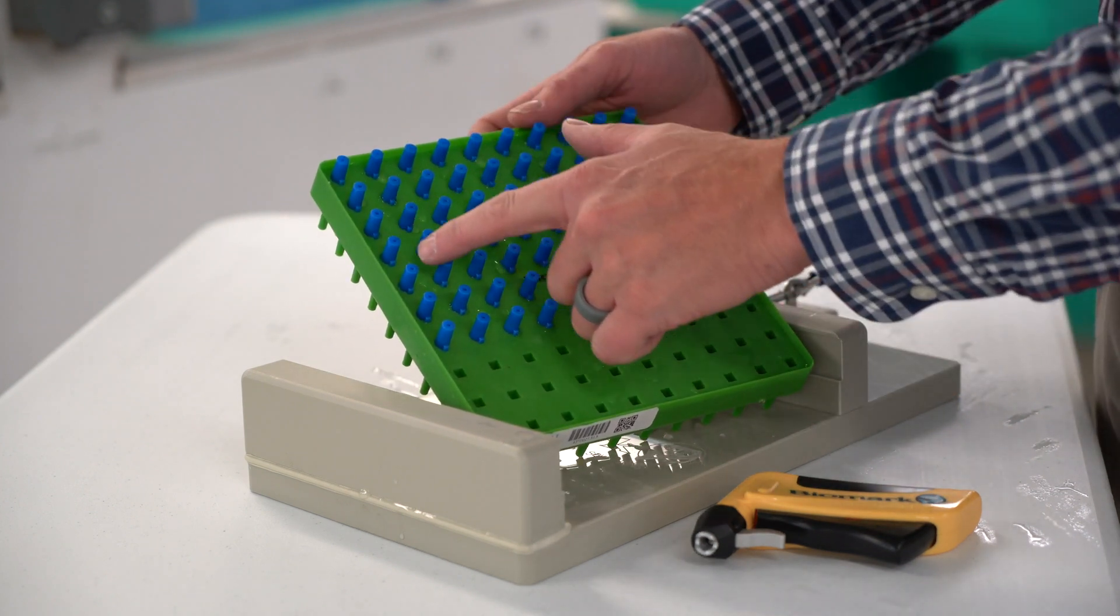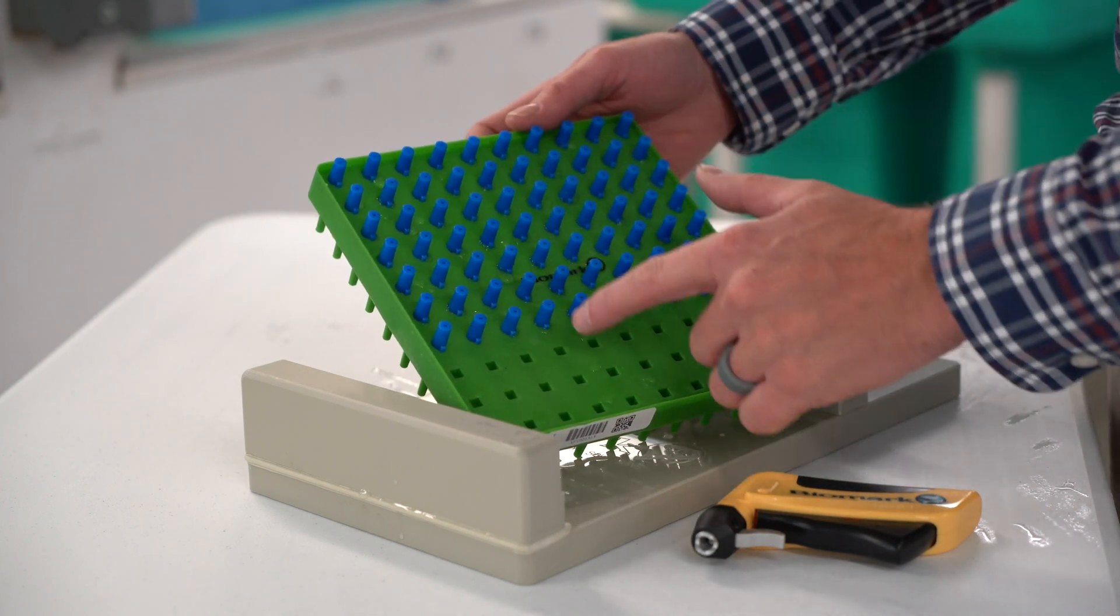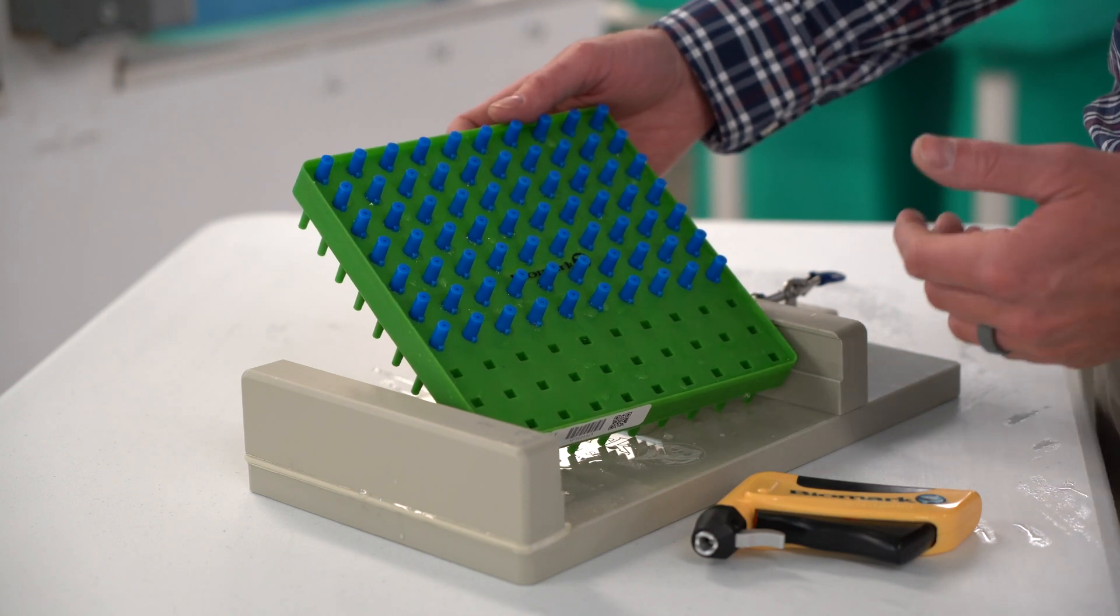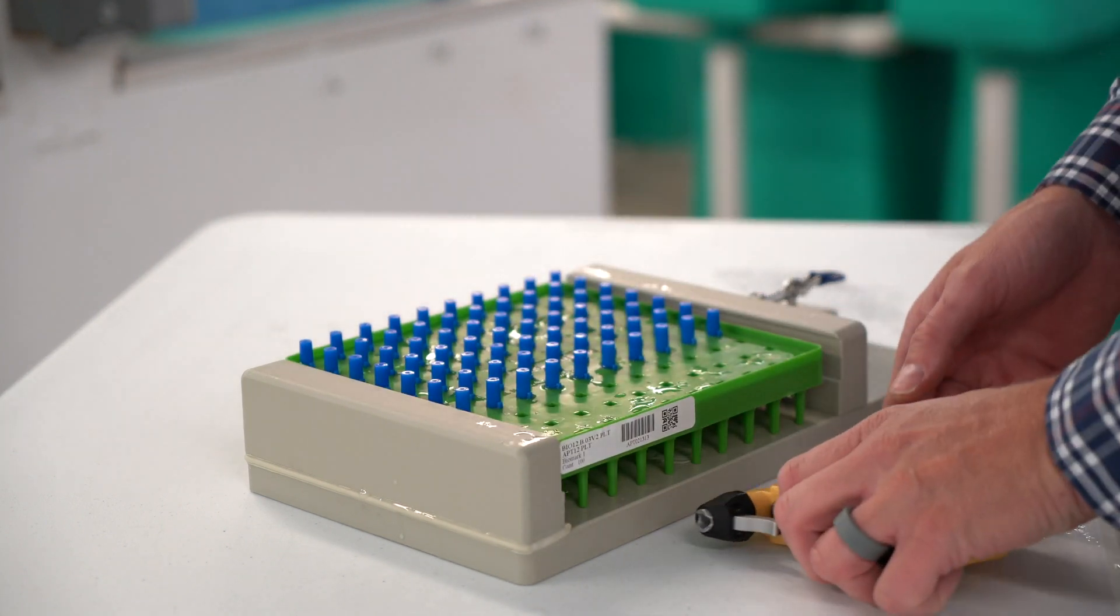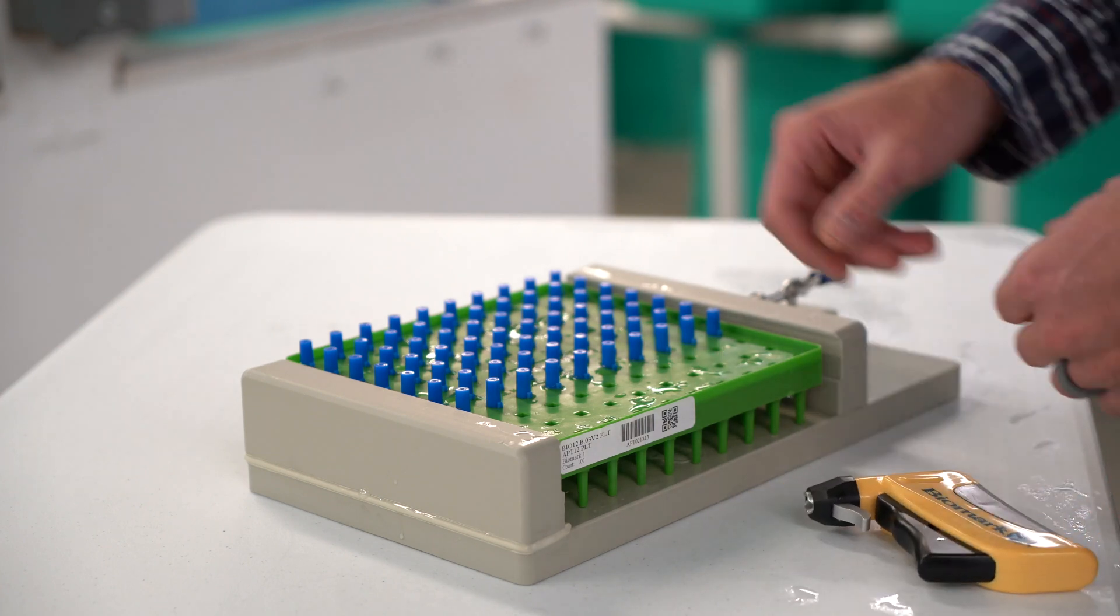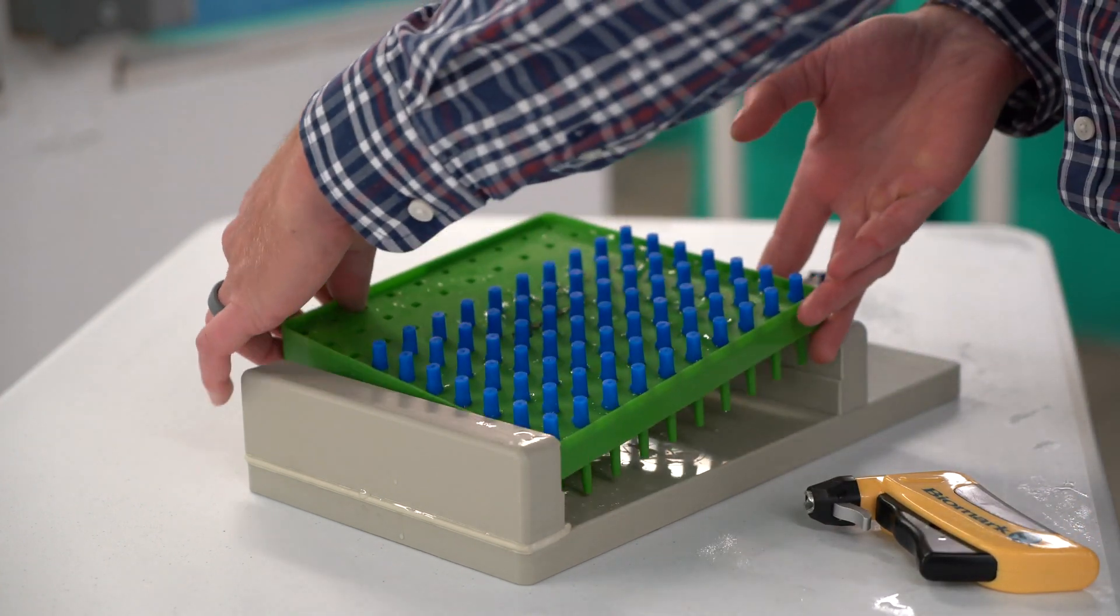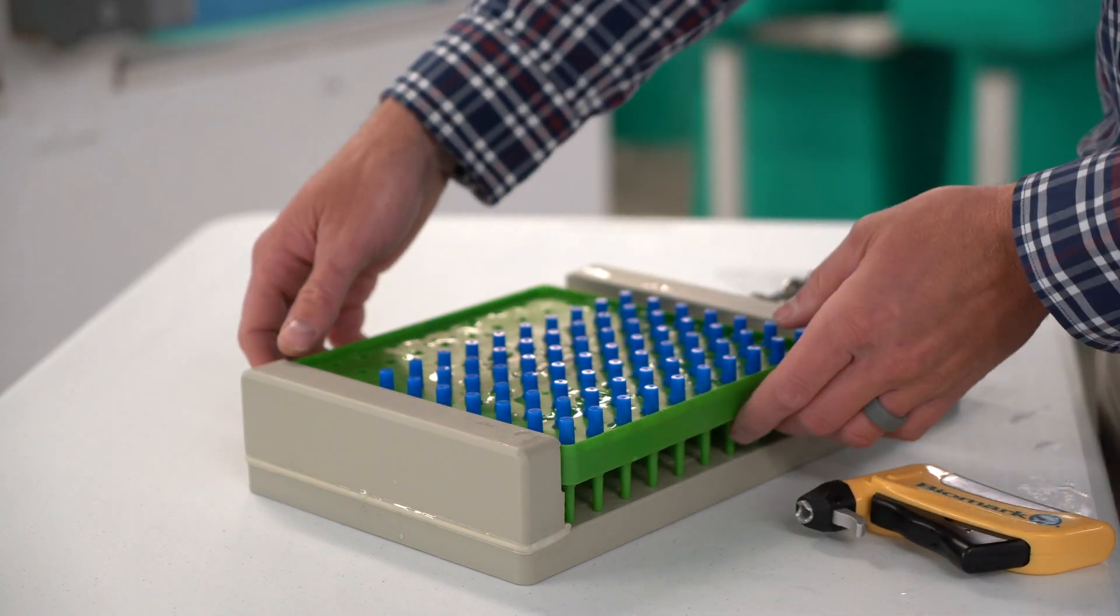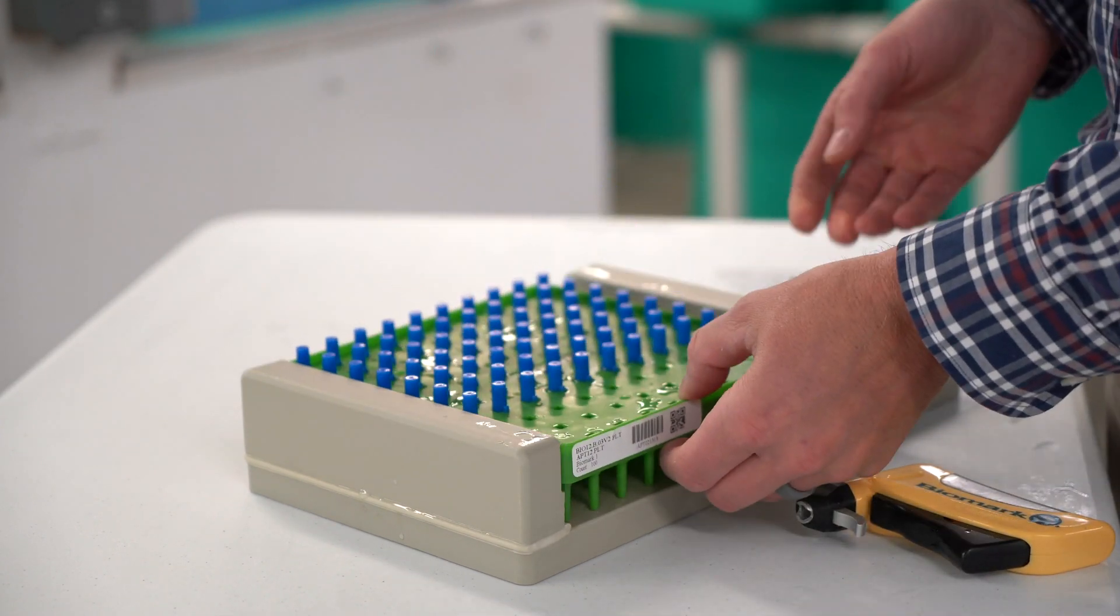Each tray is designed to accommodate left-handed and right-handed taggers. Note each needle has a small tab. All tabs are aligned in the same orientation. For right-handed users, the tabs should be facing the tagger. For left-handed users, the tray can be rotated 180 degrees, and the tabs should face away from the tagger.